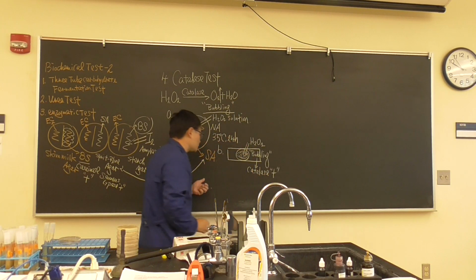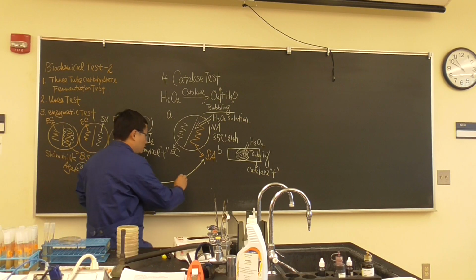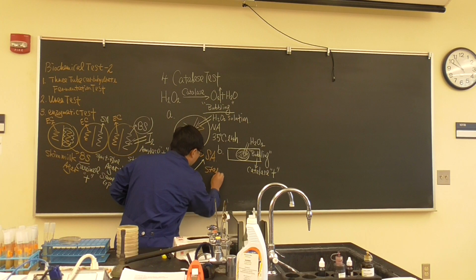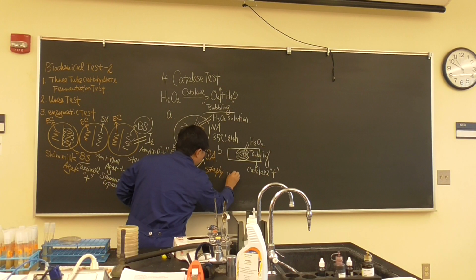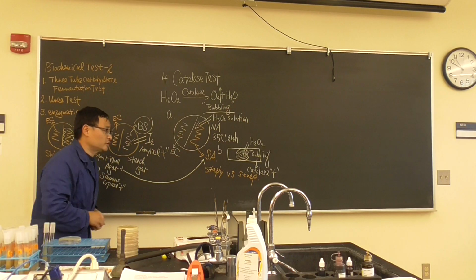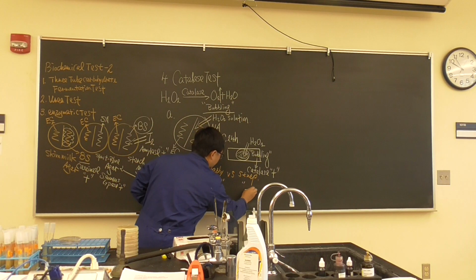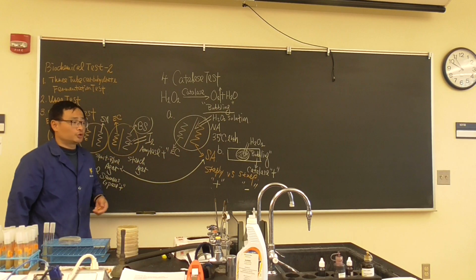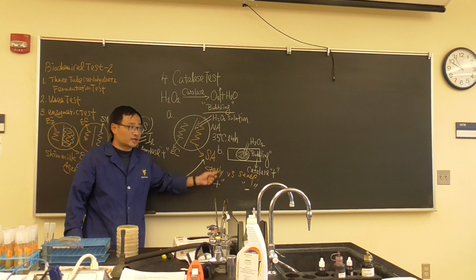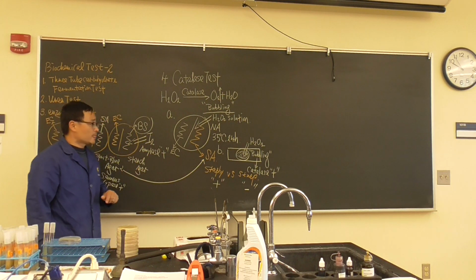Now, catalase test is very important. We already mentioned in the lecture because of Staphylococcus versus Streptococcus. Staphylococcus is catalase test positive, Streptococcus is negative, which means one side is bubbling, the other side is not bubbling. This is what we talked about in the lecture.